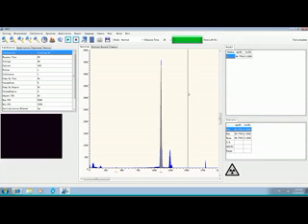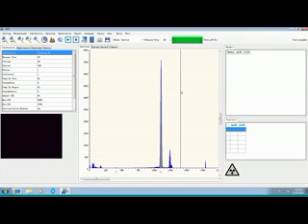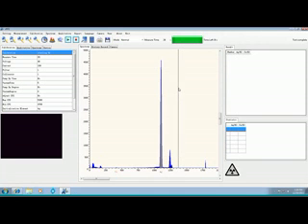Now what we're going to do is we're going to put a sample in here, an unknown sample, which is going to be a standard or a piece of jewelry. In this case, the only thing I have available is a standard, so I'll just throw this on.